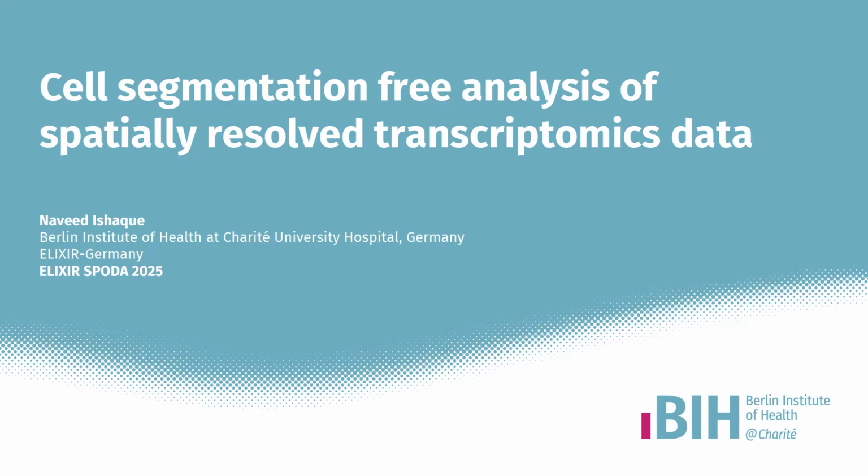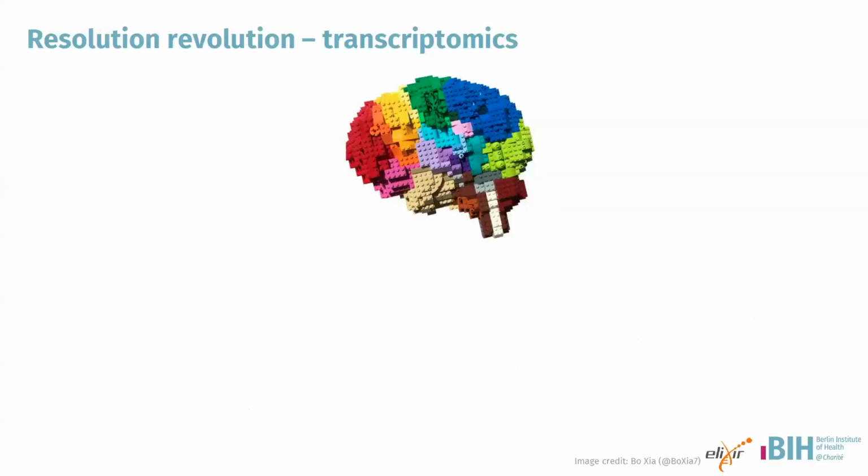I will switch gears a little bit. I will break away from the normal analysis workflow for spatial transcriptomics and talk about an emerging paradigm called cell segmentation-free analysis. Hopefully through this talk, I will explain to you what this means. We talked a lot about cell segmentation yesterday, and I'll give a few more examples, and then talk about how we can actually analyze this data without even thinking about cells and really trying to take gene expression in their spatial context.